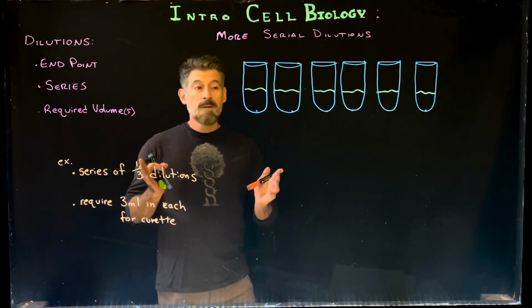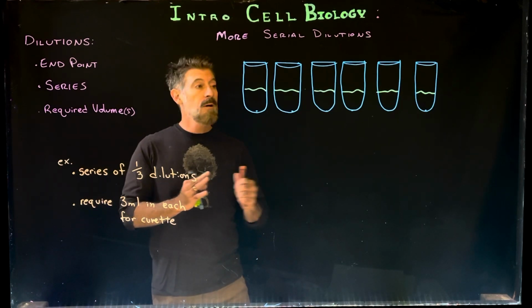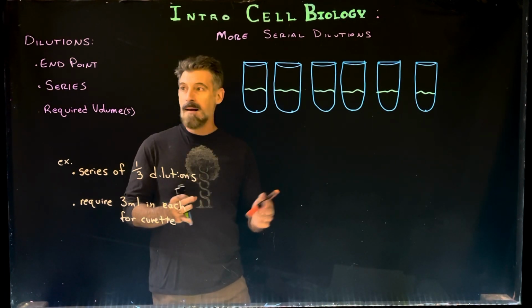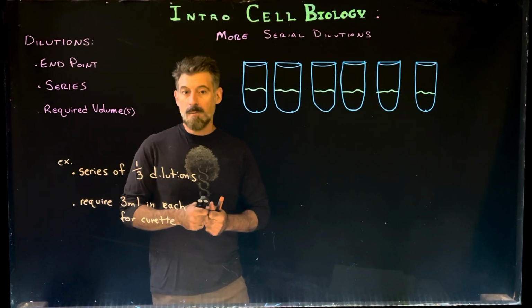So I'm going to try to expand on explaining serial dilutions and how to prepare and plan to make serial dilutions. And I already have another video on the general aspect of doing that. So I'm going to repeat a little bit of that and then try to get into a couple different sort of things that are a little more complicated that I find some people having trouble with.